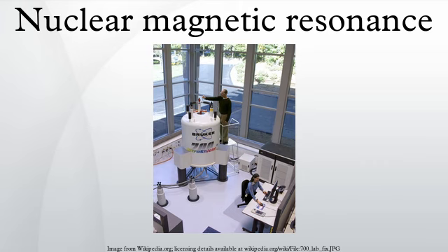Multidimensional NMR spectroscopy, the use of pulses of different shapes, frequencies and durations in specifically designed patterns or pulse sequences, allows the spectroscopist to extract many different types of information about the molecule. Multidimensional nuclear magnetic resonance spectroscopy is a kind of FTNMR in which there are at least two pulses and, as the experiment is repeated, the pulse sequence is systematically varied. In multidimensional nuclear magnetic resonance there will be a sequence of pulses and, at least, one variable time period.